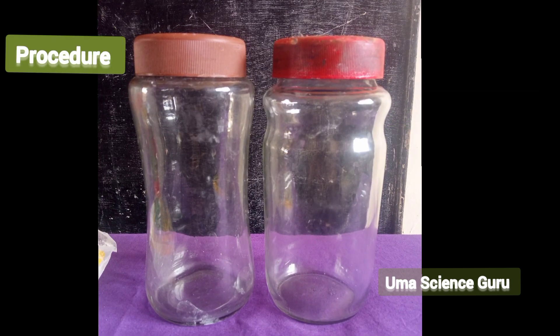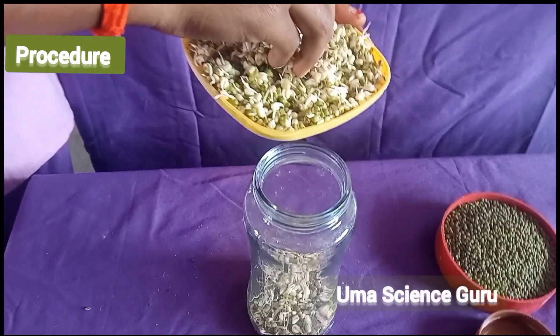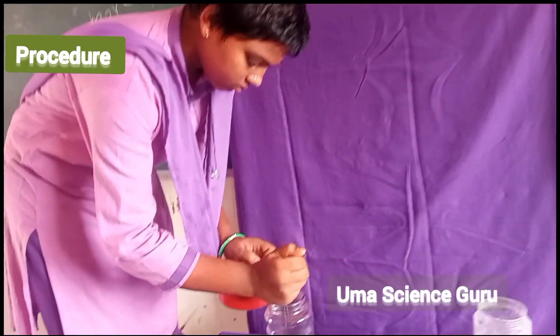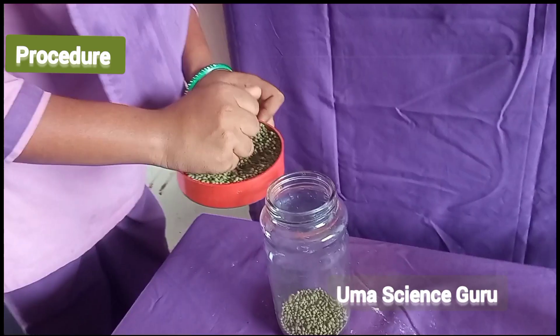Procedure for this experiment: take two clean, transparent and wide-mouthed bottles. Take some germinated seeds in one bottle and take some dry seeds in another bottle.